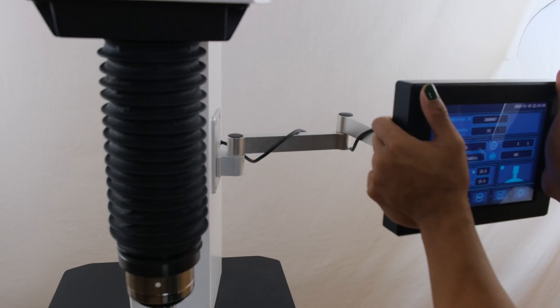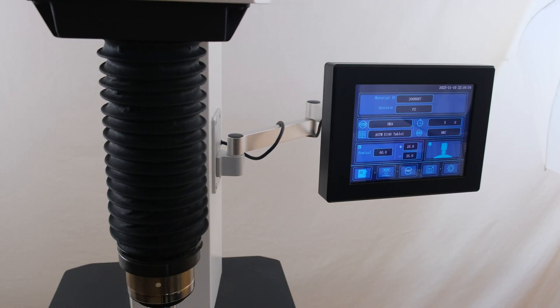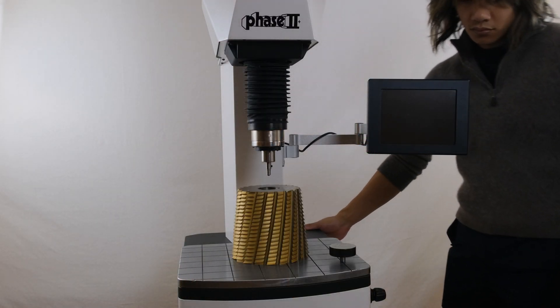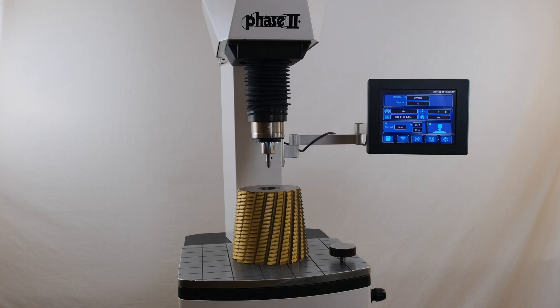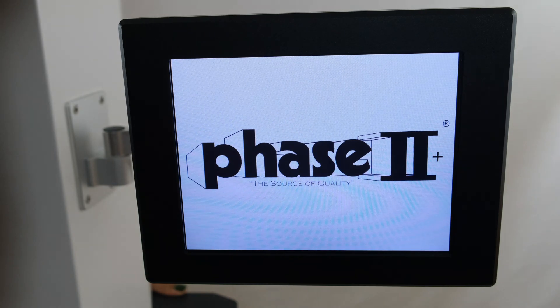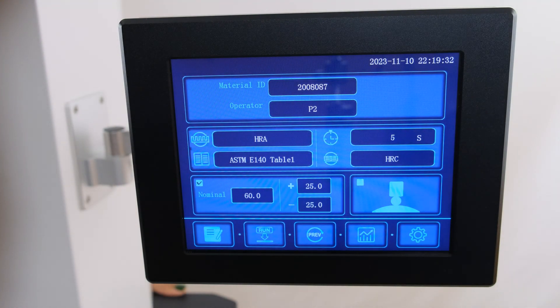The touchscreen controller is externally mounted and can be adjusted for ease of viewing. After powering on the machine, there will be a brief startup sequence where the indenter head will move away from the work surface. The first test parameter screen will be displayed along with navigation buttons along the bottom for the rest of the features of the machine.